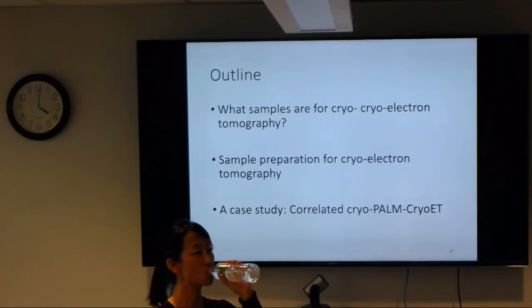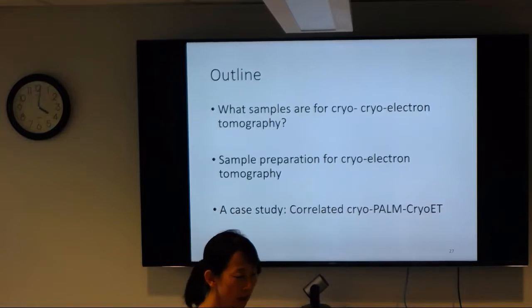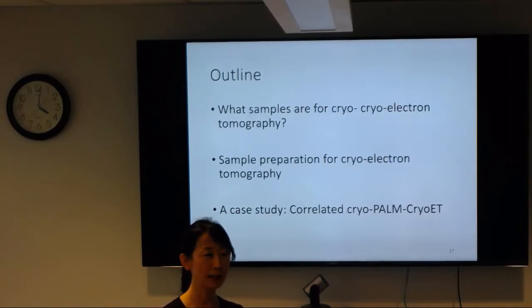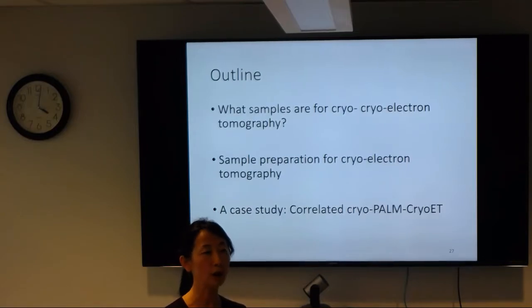What kind of protein coatings do you use to grow your mammalian cells on this grid? Oh, that's very cell specific. Polylysine is my favorite one. If I have a new cell type I want to try, I usually just use polylysine. No special reason. It worked with many cell types, but for some cells, maybe another coating protein, collagen for example. There is a list of proteins you could try, and also concentration.